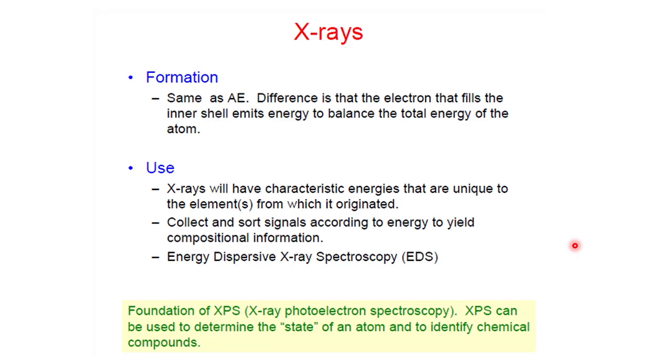In that way we can check how homogeneous your blend is, and what different phases are present in your material.